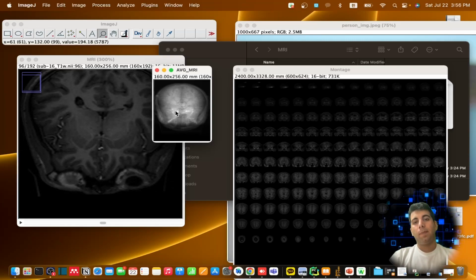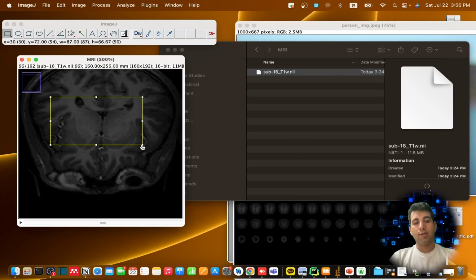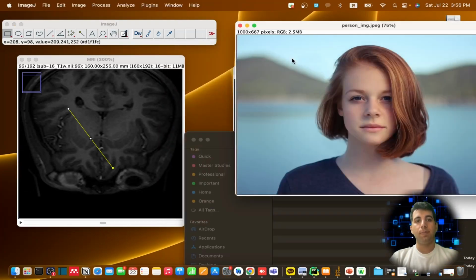So yeah, you can do this basic analysis in here, and you can draw something and then just click download. You can draw an oval, you can draw different points, or multi-shape. You can measure if you want to measure something, for example from this point to here, what's the size. If you want to see a particular image location, you can simply get that location.